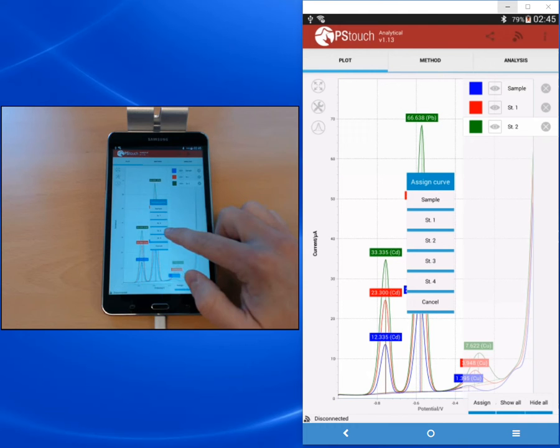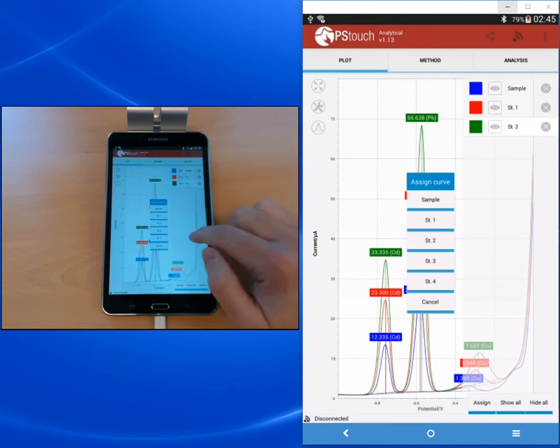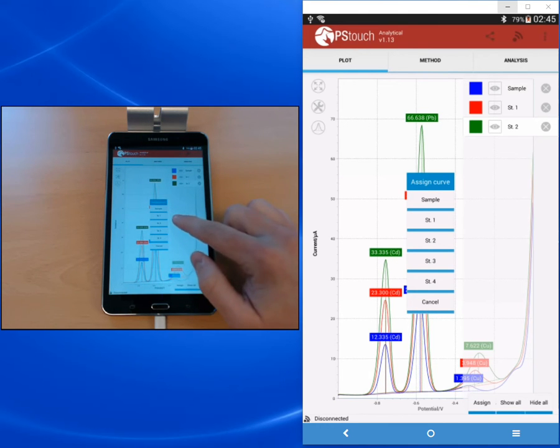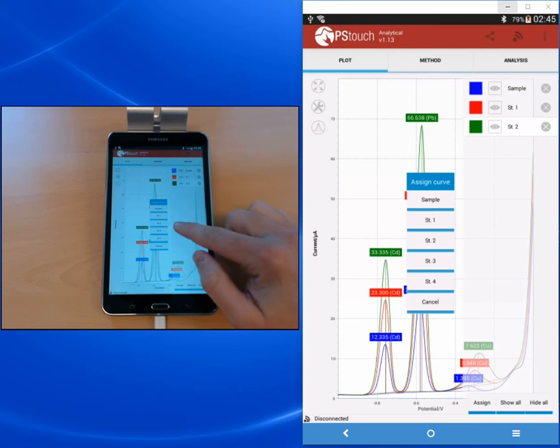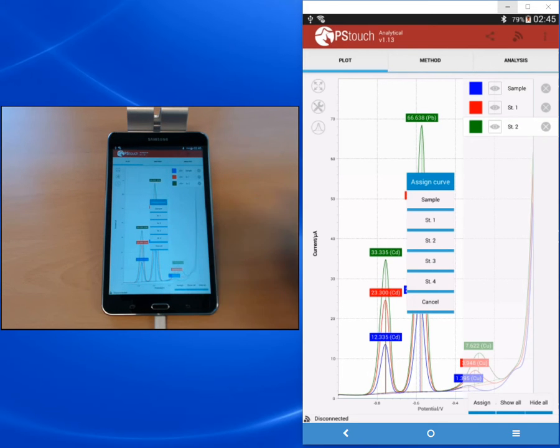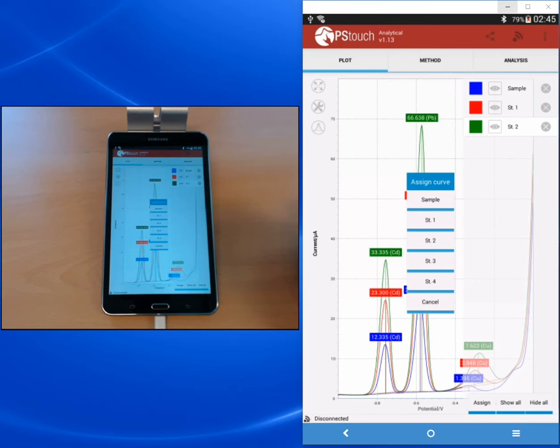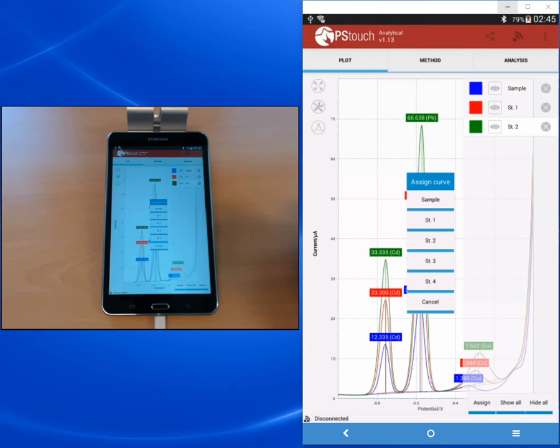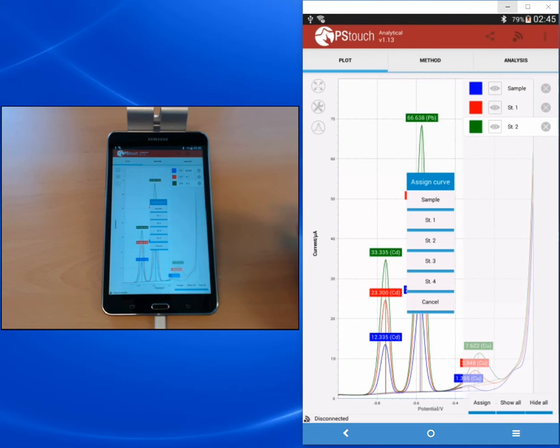You have the options to assign a sample, standard one, standard two, standard three, standard four. What these actually mean depends on the approach you choose. In a calibration curve, usually standard one, two, three, four are solutions with known concentrations that will make your calibration curve, usually a linear fit, and then the sample will be measured with an unknown concentration.